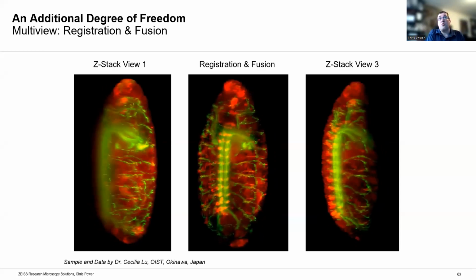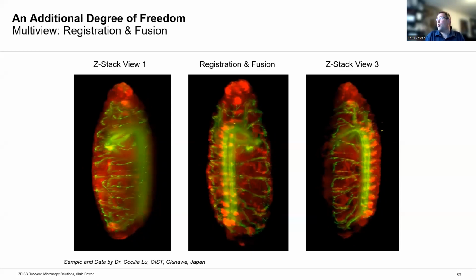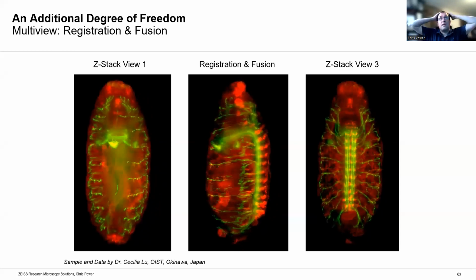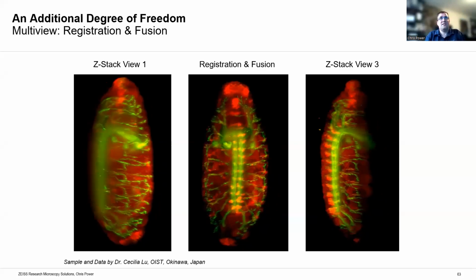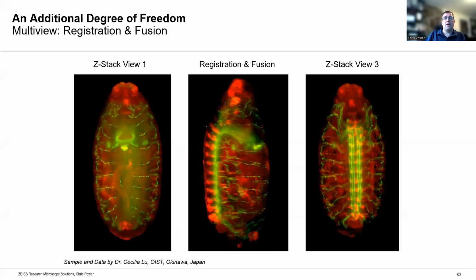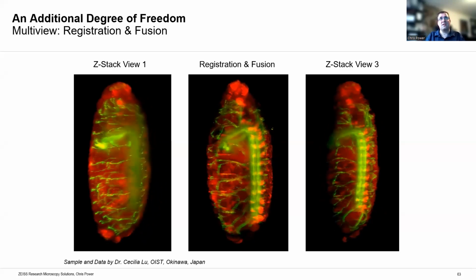So that was how the Lightsheet came out, 2012 up to about 2015. But then people began to come to us more and more and ask about cleared samples. Cleared samples originally weren't in our brain when we developed Lightsheet, because we thought this system is amazing for live cell, and cleared samples you can image on any microscope. But the more we thought about it, clearing really makes sense with Lightsheet, and it makes sense for a few reasons.